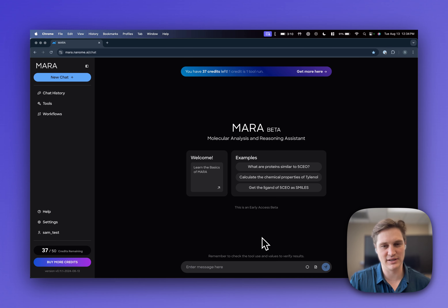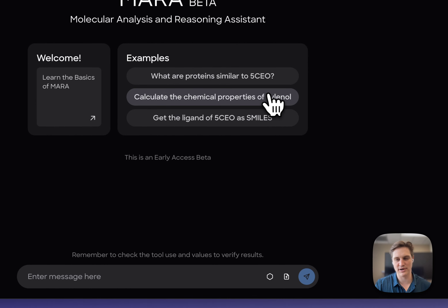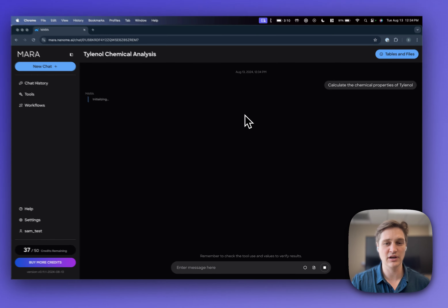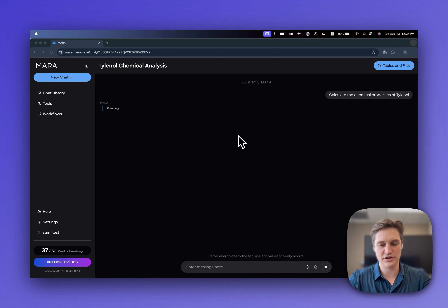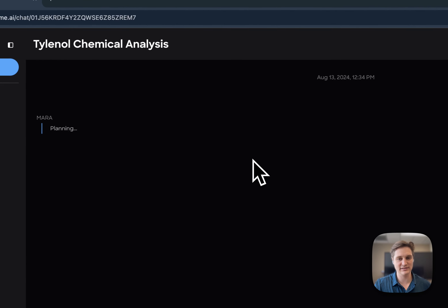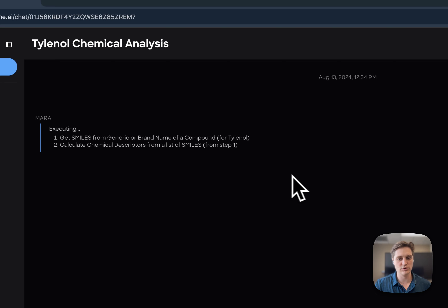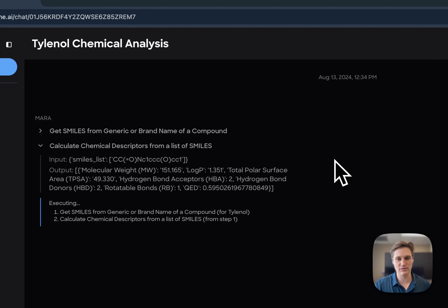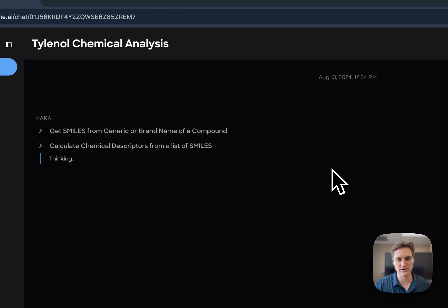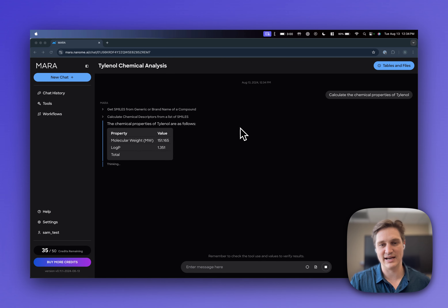I'm going to start with a simple example: what are the chemical properties of Tylenol? You can chat with Mara to do scientific informatics tasks in just plain English. You can see that Mara is initially planning and thinking to use the tools it has at its disposal to get you the right answer. It previews the plan to you, executes the tools, and then provides an AI summary.